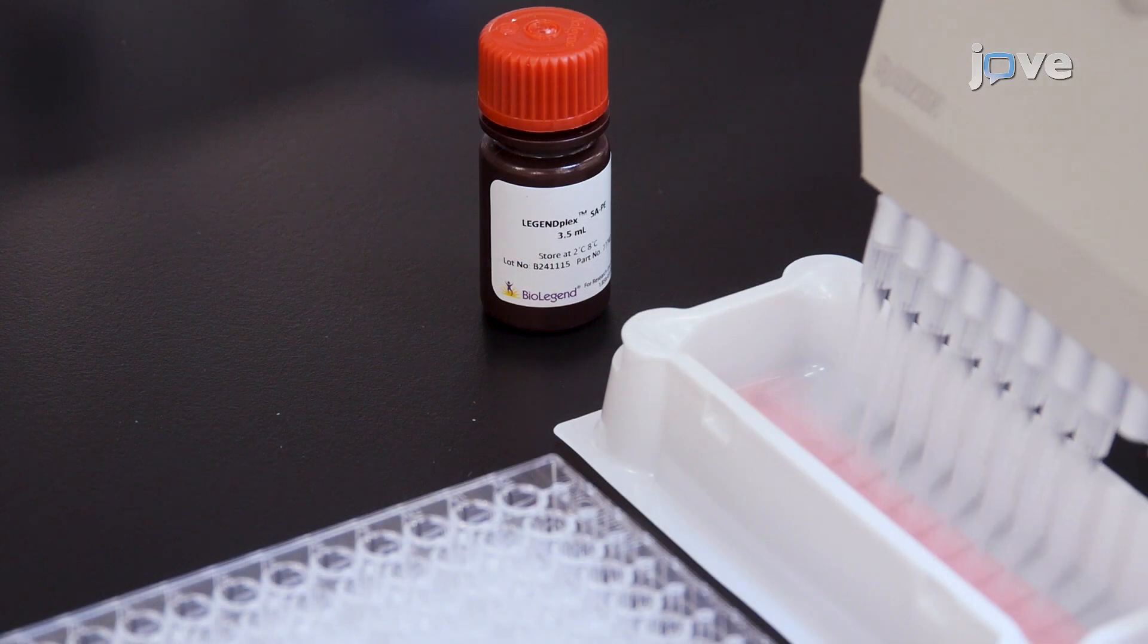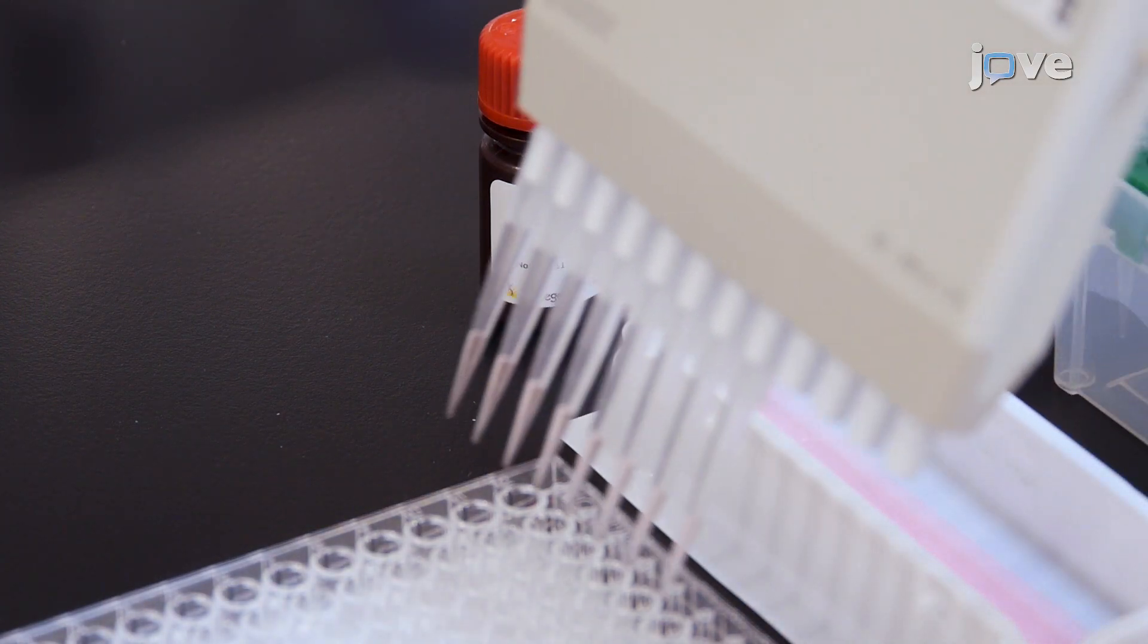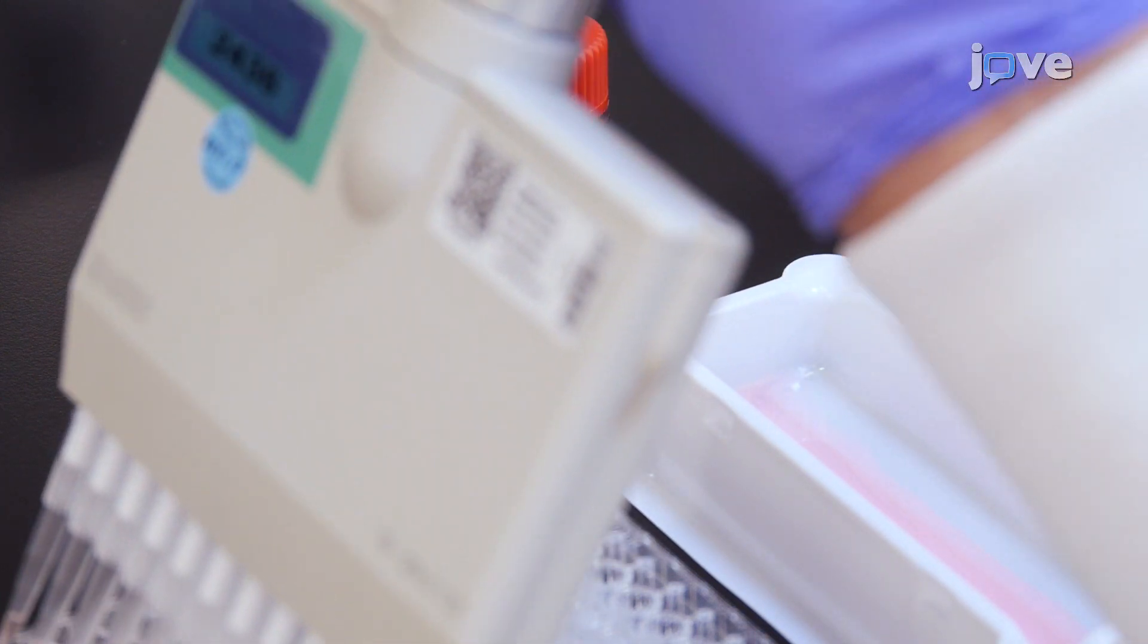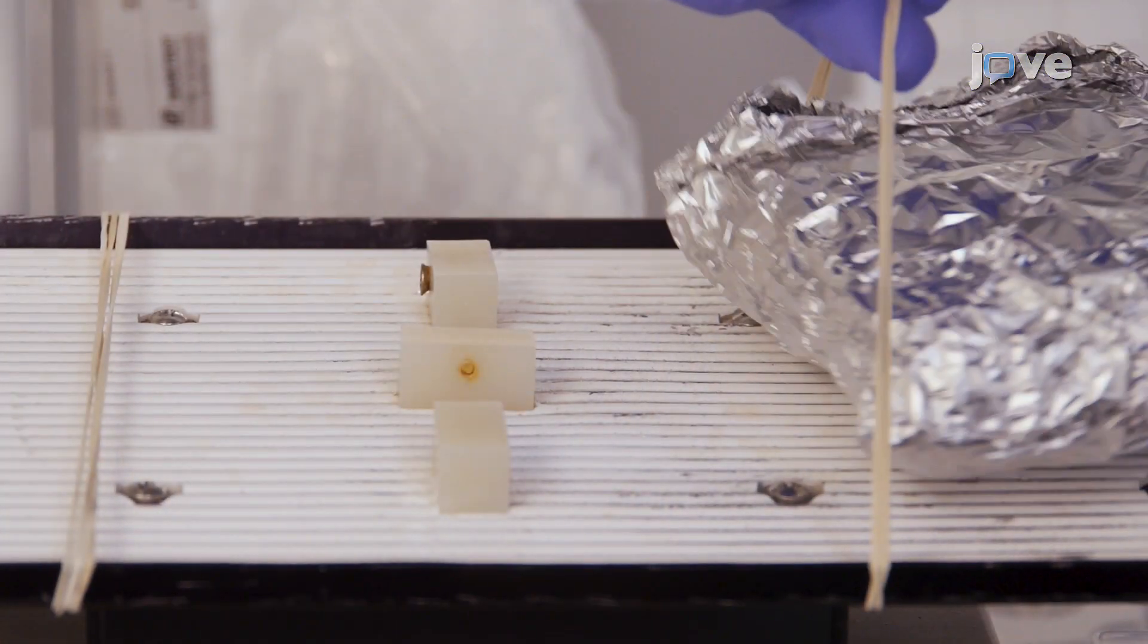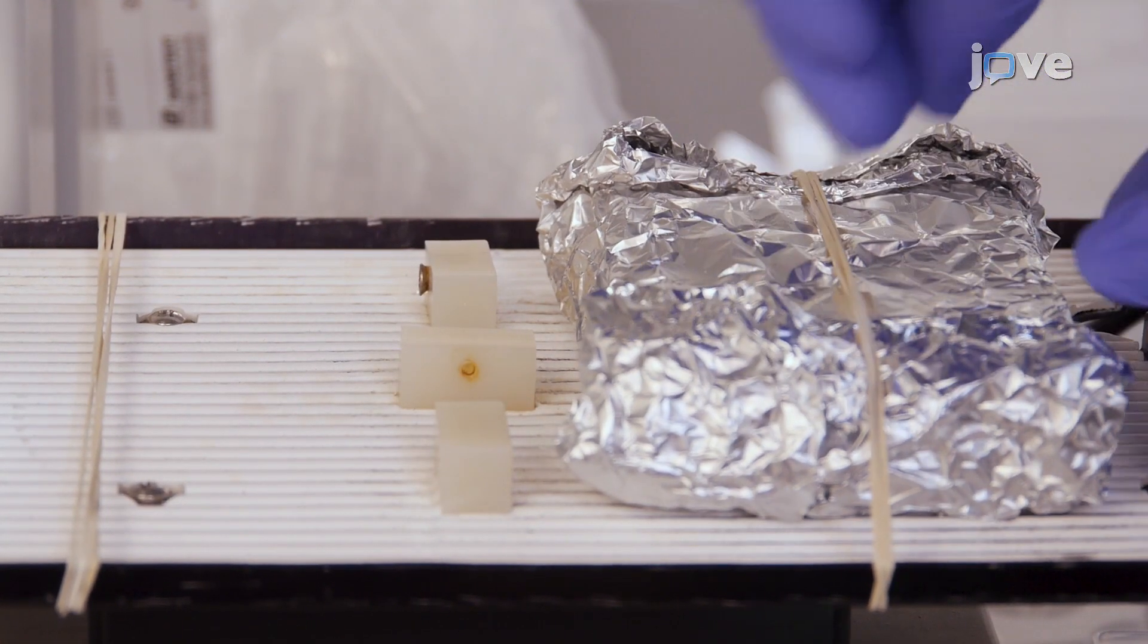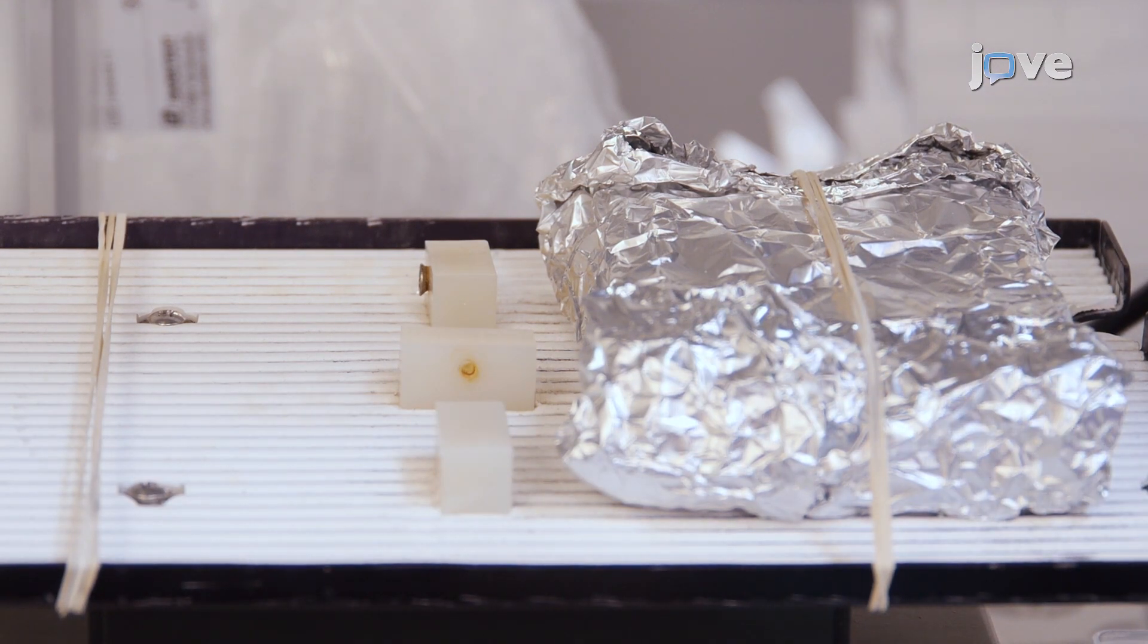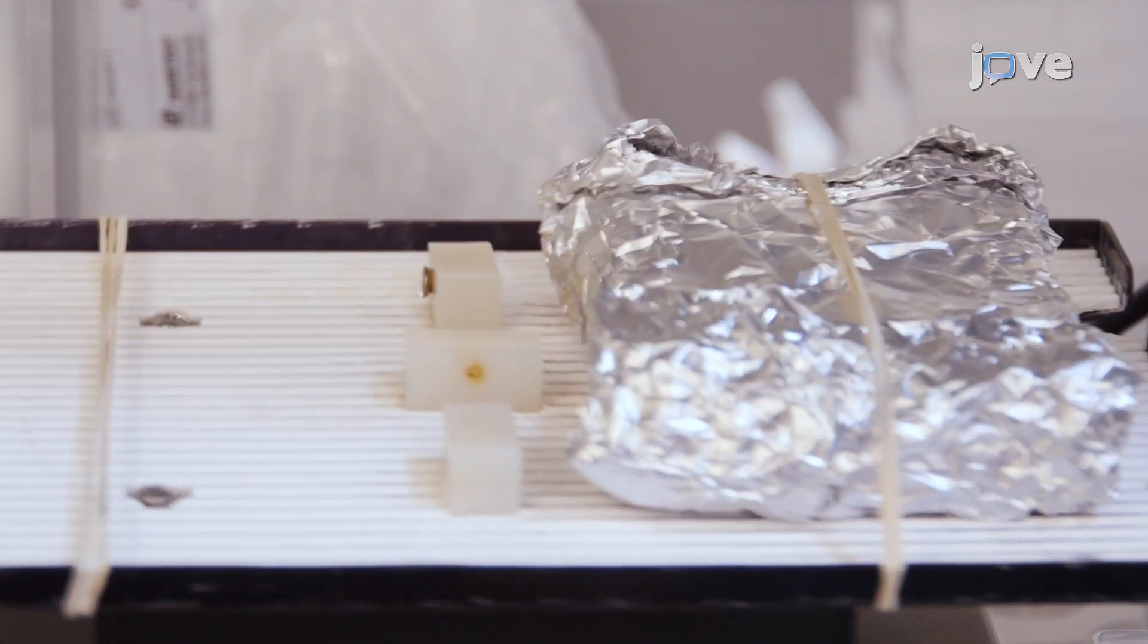Without vacuuming, add 25 microliters of streptavidin-phicoerythrin reagent directly to each well. Seal and wrap the plate as before. Then place the plate on a plate shaker, and shake at approximately 500 RPM for 30 minutes at room temperature.